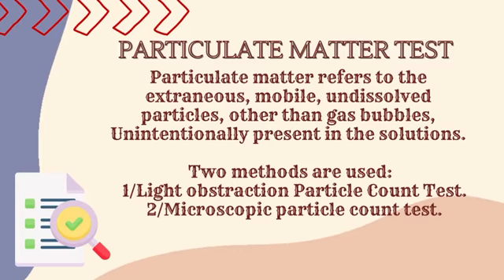Particulate matter test. Particulate matter refers to the extraneous, mobile, and undissolved particles, other than gas bubbles, unintentionally present in the solution. 2 methods are used: 1. Light obstruction particle count test. 2. Microscopic particle count test.